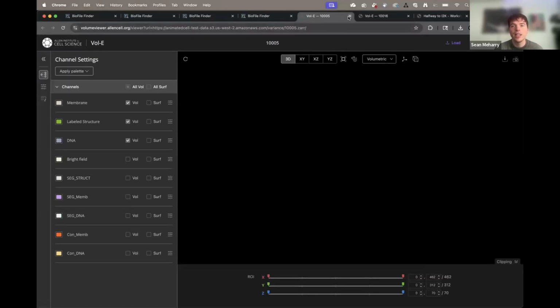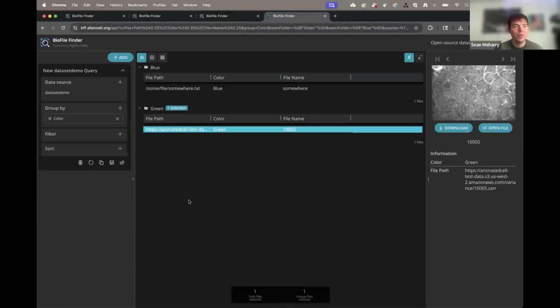And that lets us do pretty much everything. So that is my demonstration of BFF very quickly. Do we have any questions?